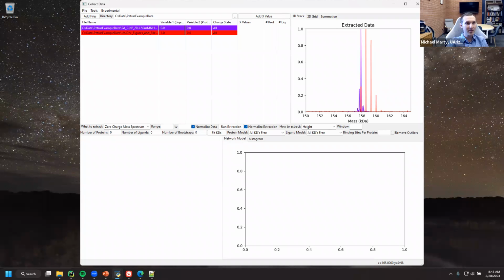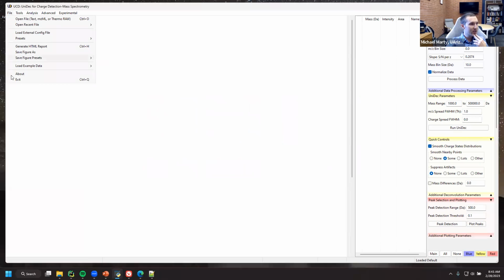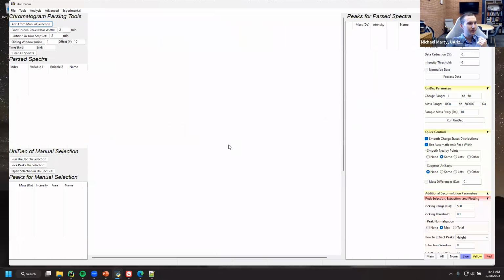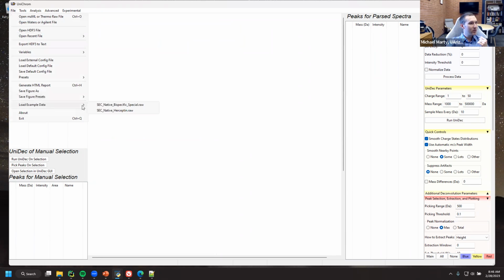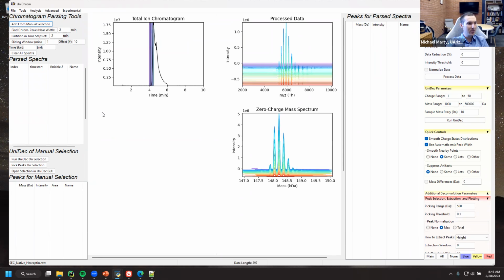How about checking out some of the chromatography stuff while we're at it? Let's go back, reopen UniDec CD. I'll show some examples. This is some stuff I got. Oops, sorry, that's the CDMS data. This is Unichrome. If we go file, we can load some example data. So here's some native SEC with Herceptin. And you can see what we've done.